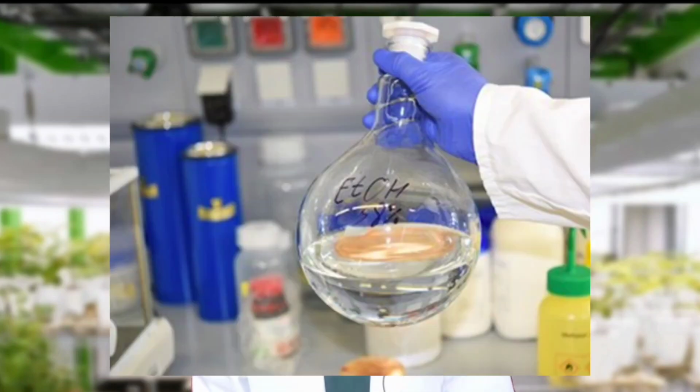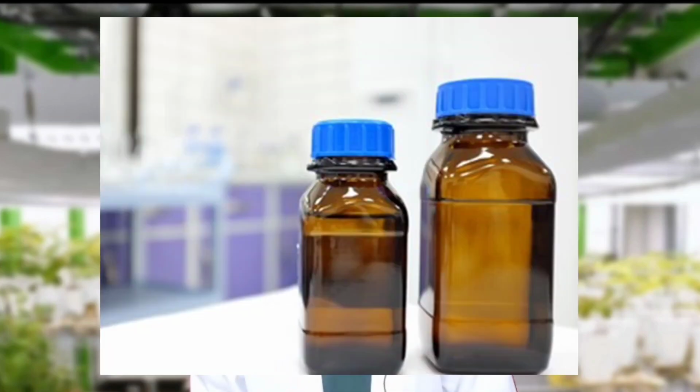Plant material can be sterilized via surface sterilization using alcohol. It does kill microbes, but if the explant is juvenile or soft, a mild treatment is more preferred. Additional supplements are also convenient to use for this purpose.